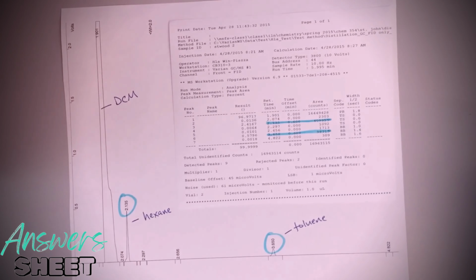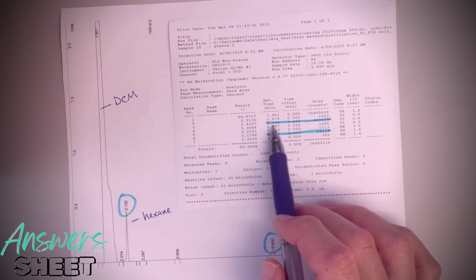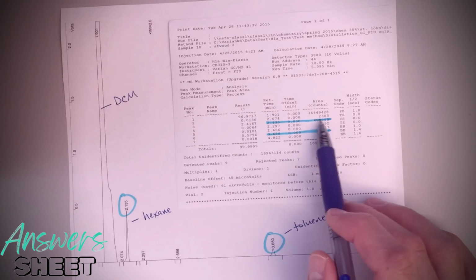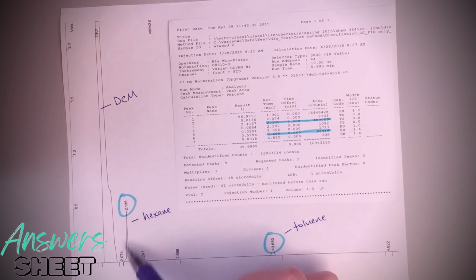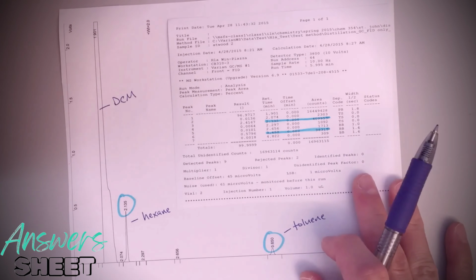Now, the next thing we're going to do is look at our actual data. So here's our actual data printout, and I'm going to look for those times. Here I see the retention time, 2.135 minutes, and then this area counts, that's going to be the area of that peak. Same thing for toluene. I've got my peak here and then my area there.